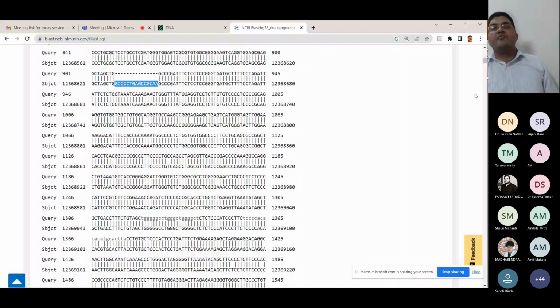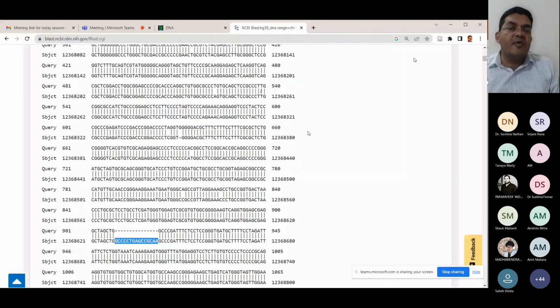What you'll see in alignment is, one, mismatches, which are marked by the absence of the vertical line. There would be a different nucleotide here and another different nucleotide here. These are mismatches, substitutions, because the nucleotide has changed, but otherwise the next few nucleotides are exactly the same. Then you'll also have a gap. It could be a small gap, for example one nucleotide, or a long gap, which is indicative of indels, or insertion-deletions, that happen during the course of evolution.